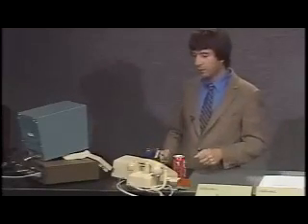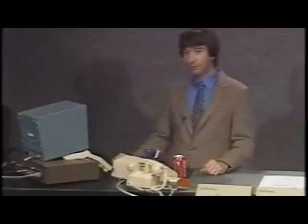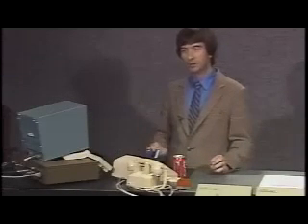So as far as you're concerned, you see an image of single ion impacts. The process of removing things from the surface is called field desorption, another word. It's like field evaporation. It's exactly the same process, but now we're self-imaging the surface.